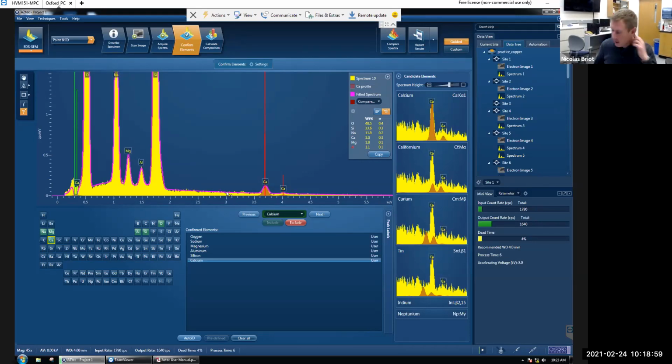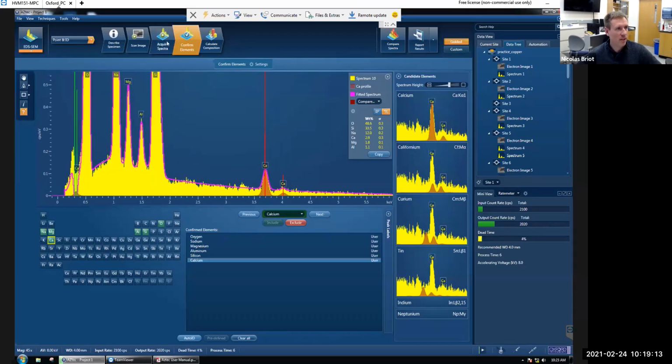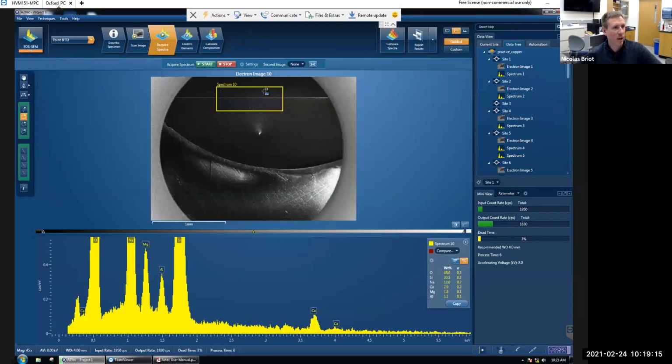It's going to be good to compare doing the cross sections, and then since you brought me also the rods not mounted, we'll also do that. Maybe we'll compare with that if we have time later today or next week. But yeah, we don't really see any silver here. Okay, but I'm inside, right? I mean, we're going to want to study also what's happening closer to the surface, of course.